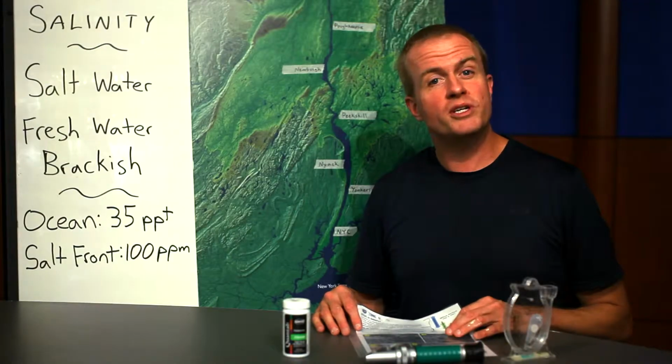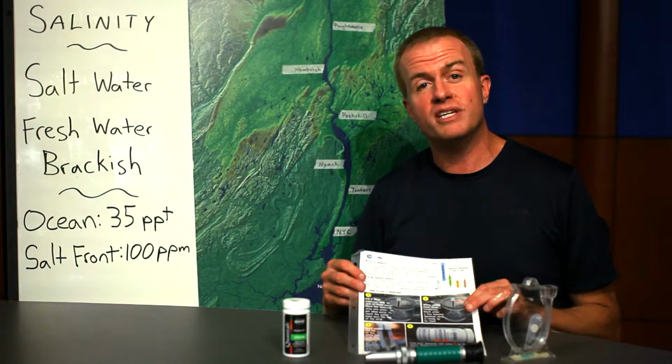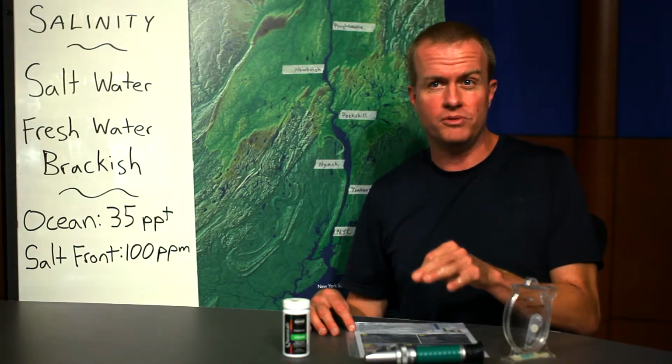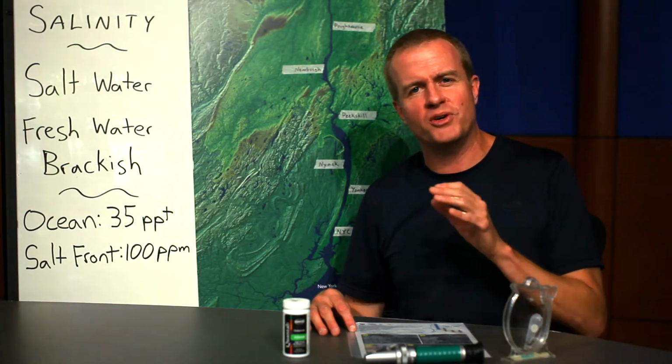The 3 methods we just went over are also available online as instruction sheets as part of our Day in the Life of the Hudson River resources. Remember to record your units and whichever method you use. Salinity is one of the most important and dynamic parameters on the estuary.